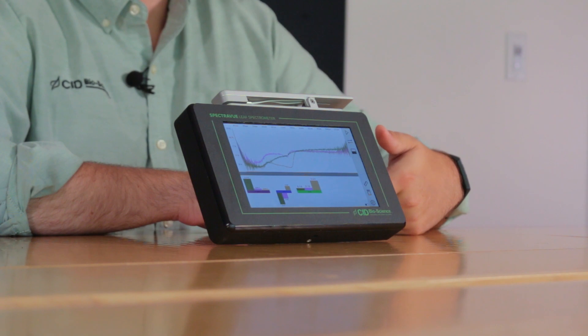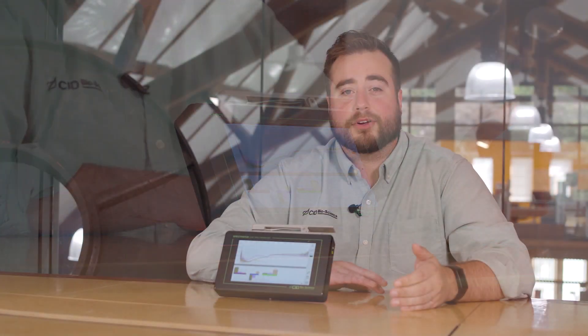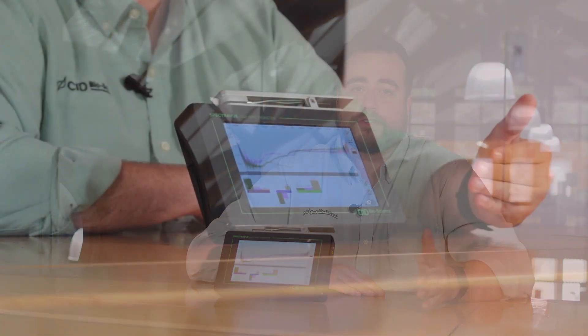This means that you can use the instrument to study things like plant stress due to environmental factors, as well as looking at phytochemical content like anthocyanins and carotenoids, or chlorophyll, or even looking at micronutrient content by deploying a chemometric model based on mathematics like partial least squares regression.